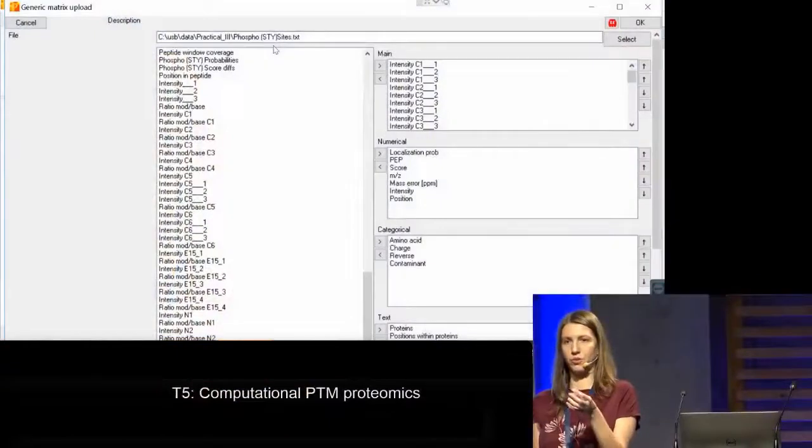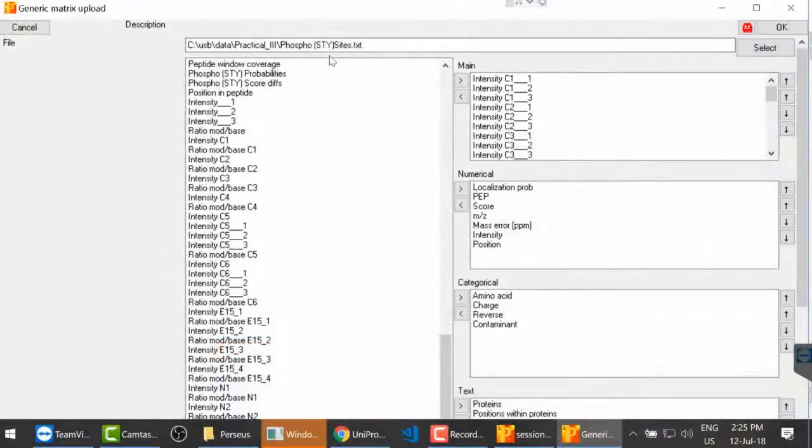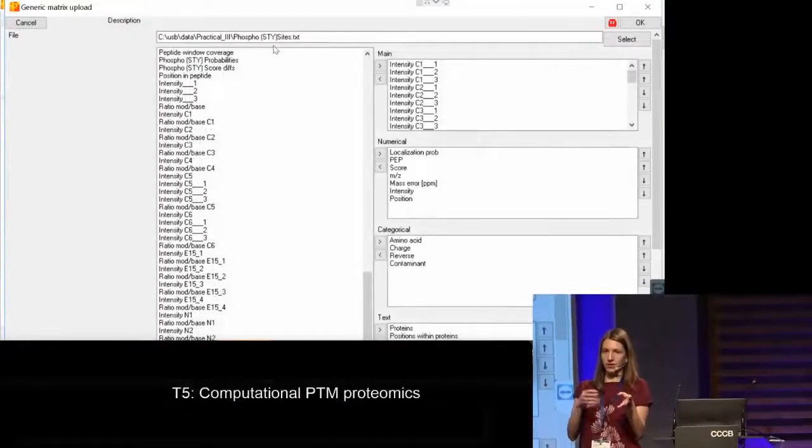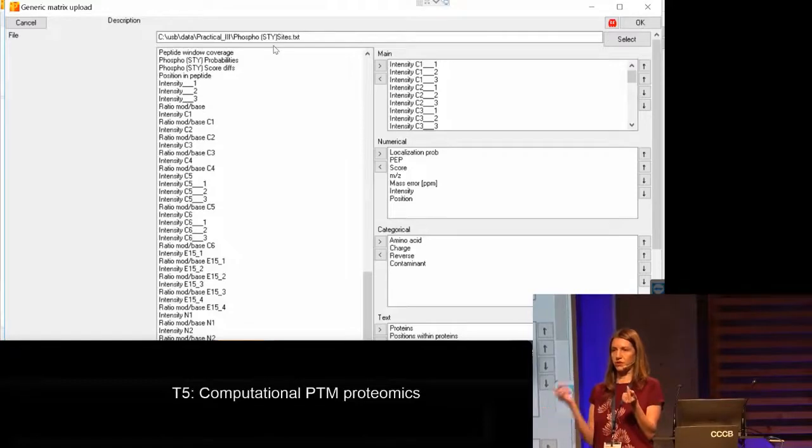So it's possible that you once see a peptide that has just modification on the first serine, but it's also possible that you see a peptide that has modification on the 2 serines, or maybe yet another one where you see a modification of the serine and the threonine. So in this case, when you have _1, this corresponds to modification of only one site. So it means that you would know exactly it is the first serine, and this is the quantification that corresponds only to the peptide with one modification.